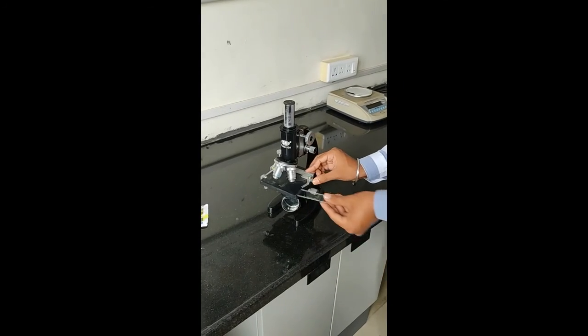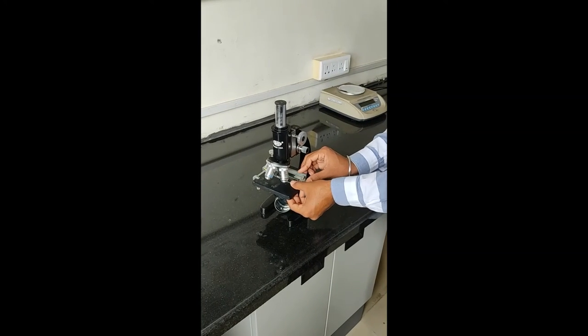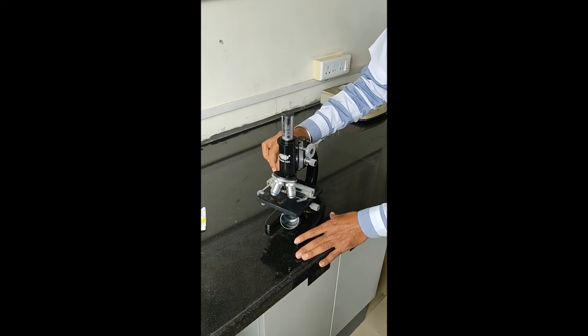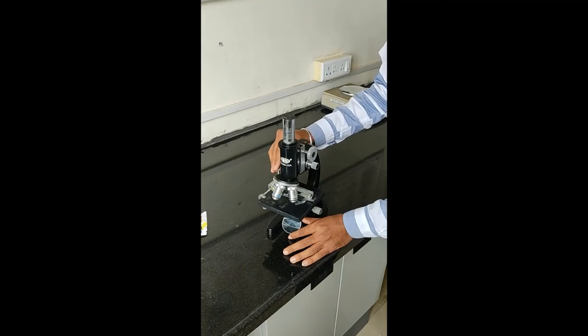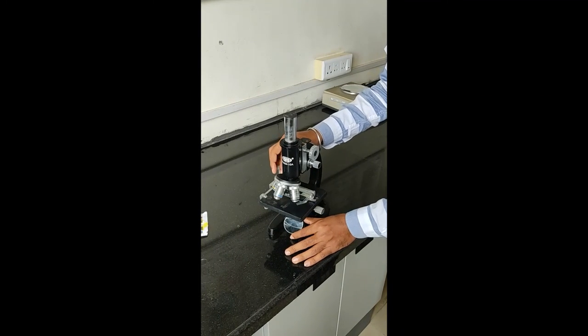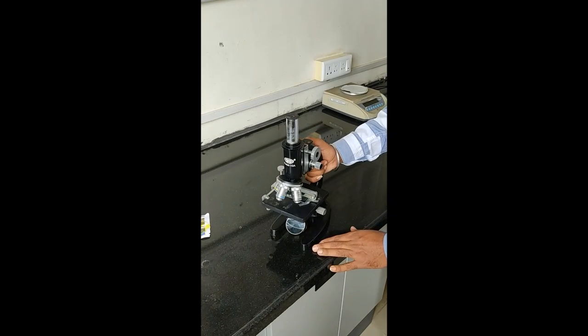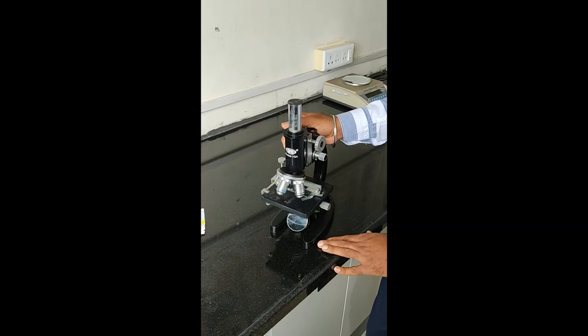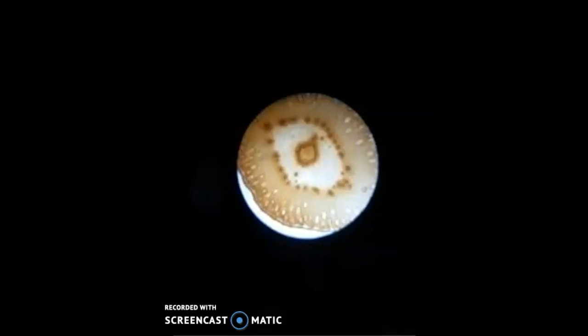Now put the slide on the stage of the microscope and adjust the alignment of the TS under the objectives of the microscope. Now you can observe the transverse section of the crude drug. The given crude drug is found to be clove bud.